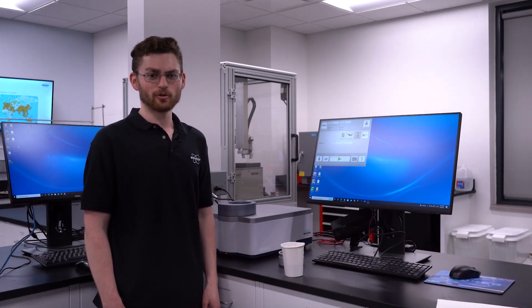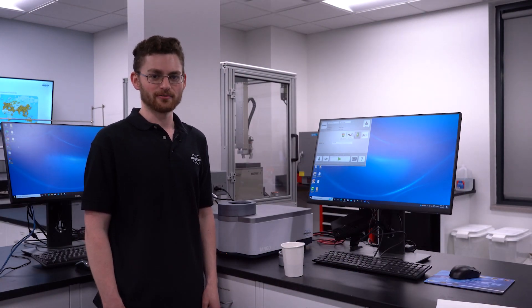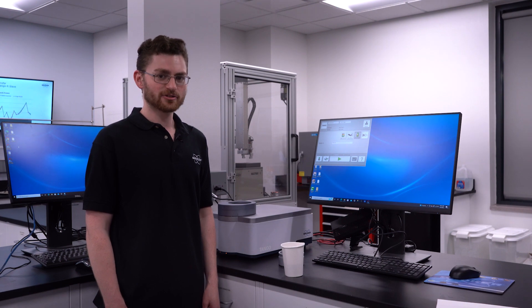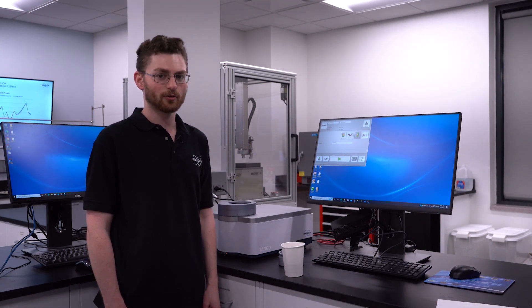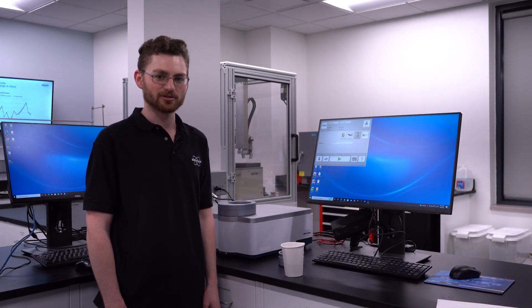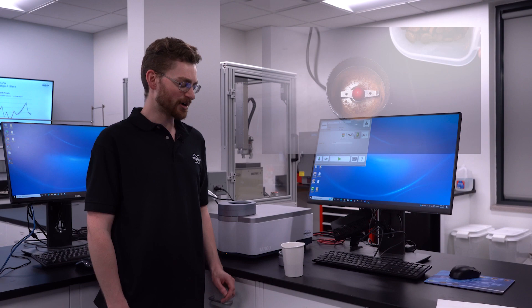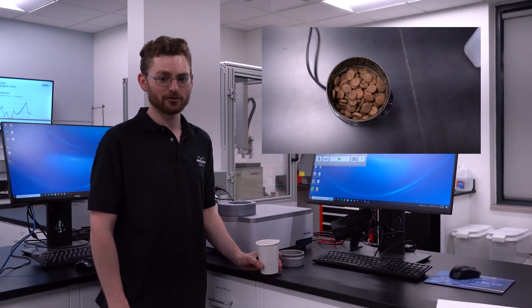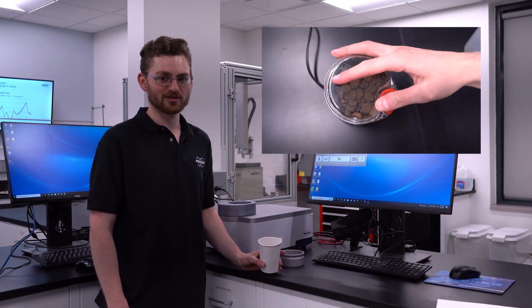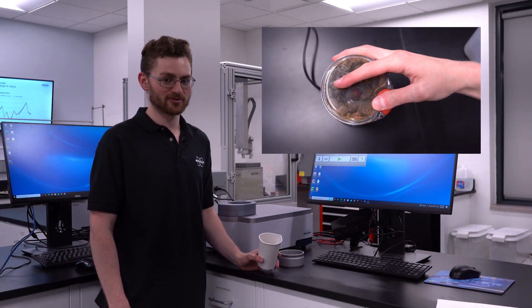For this demonstration, we will be measuring dry pet food. You can also measure wet pet food with the Tango. In the instance you do, you'll want to use a petri dish. We recommend grinding up the kibble to improve accuracy and precision.